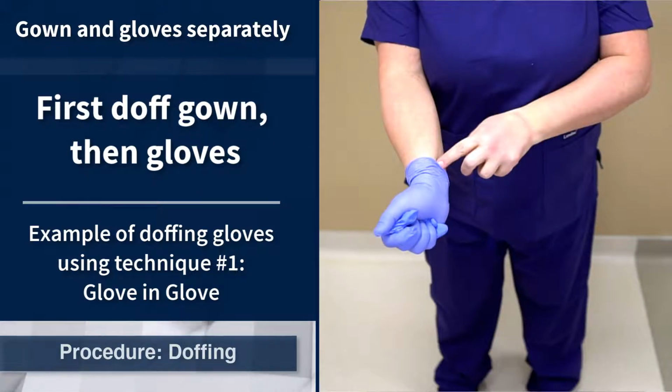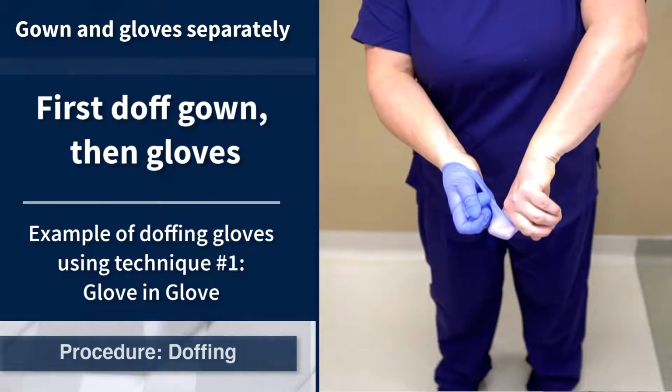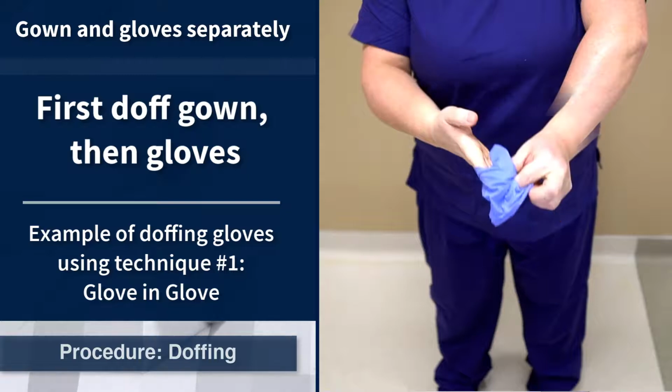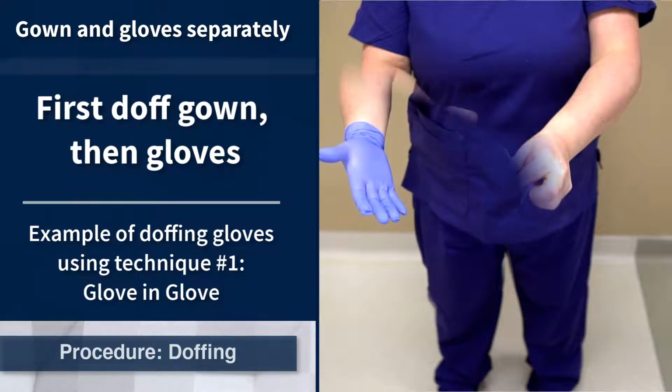Slide the forefinger of the non-gloved hand into the wrist of the other glove and pull it off. Make sure to only touch the inside of the glove, and that the glove turns inside out and envelops the other glove.